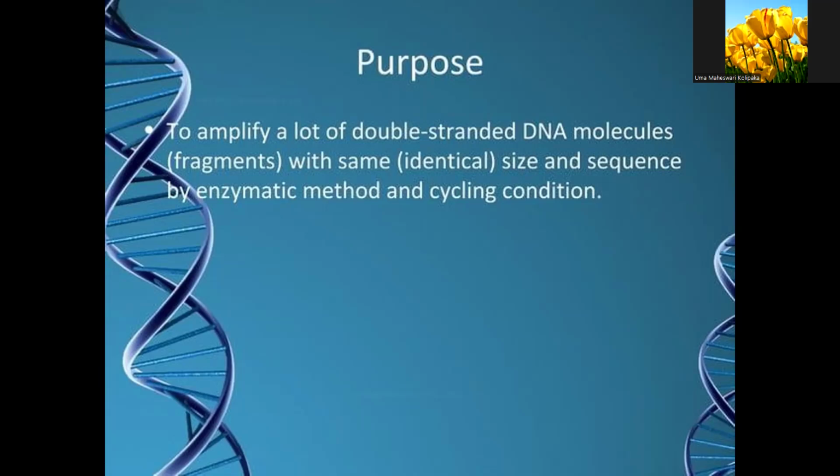We complete n number of cycles, and as we complete the cycles, we get an increased number of copies of the already existing double-stranded DNA molecules.